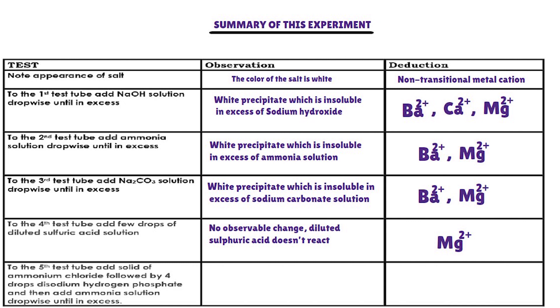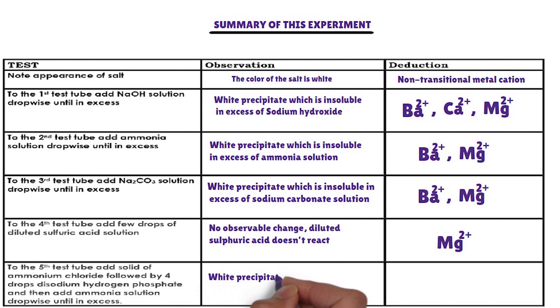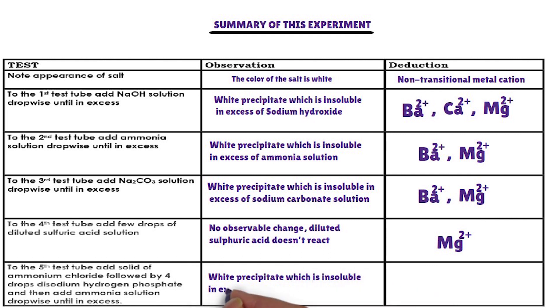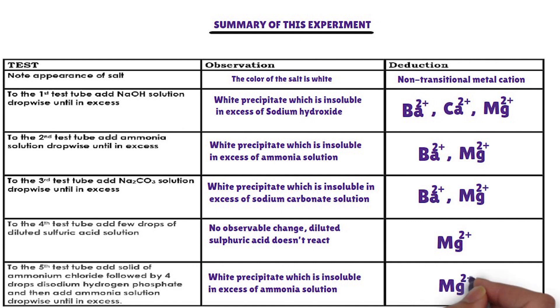Confirmatory test. In the fifth test tube, solid ammonium chloride followed by four drops of disodium hydrogen phosphate, and then ammonia solution dropwise until in excess, are added. The cation that forms a white precipitate under these conditions is magnesium ion. Magnesium ion is confirmed. The cation present in the salt is magnesium ion.